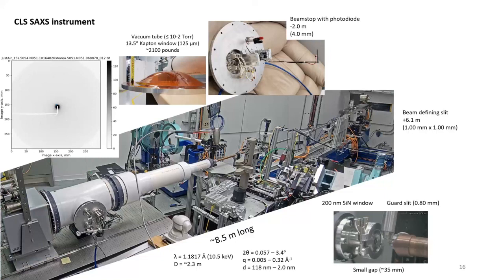Yeah, because what you're describing is like a core-shell system, right? So I think you already have the answer: the pair distribution of the SAXS. But I have seen it in the case of dendrimer and nanoparticles. But in her case there are both metal layers. Above one is also a metal layer, and I don't know the exact metal, so is the contrast between them sufficient to get information about it?